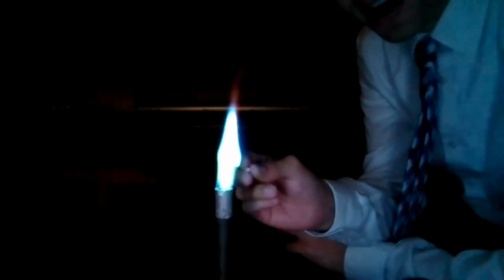So, copper. Yes, it's copper. Good job. I think that might be the first time I've heard some of you talk. Yeah, but the unknown one's copper. And how do we know it's copper? Why do we know that this one was copper? It burns green. Yeah, it burned green, and that allowed us to know that it was copper.